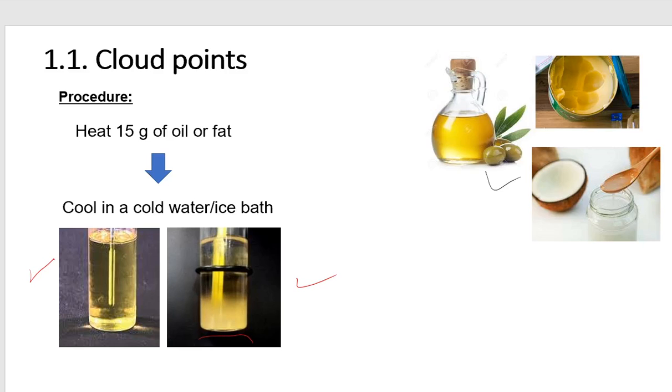The sample should be no longer visible when viewed horizontally through the bottle and sample. So the cloud point is the temperature at which the oil begins to cloud, resulting from crystallization under controlled cooling. So we are talking here about crystallization.